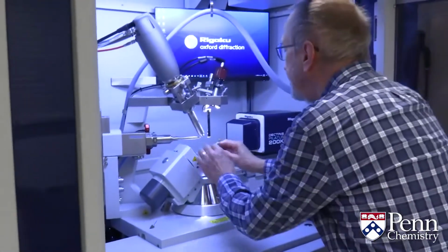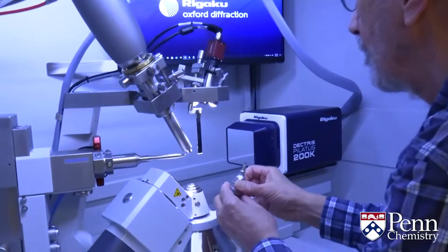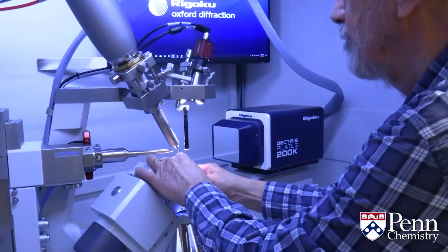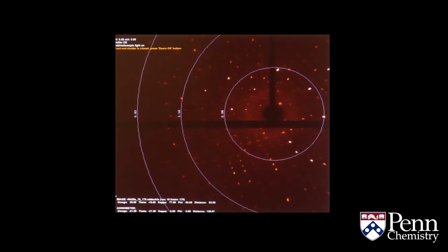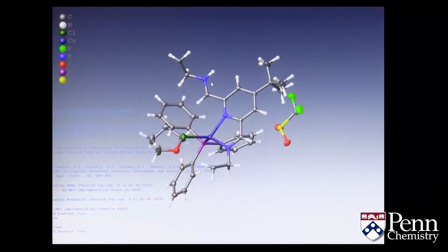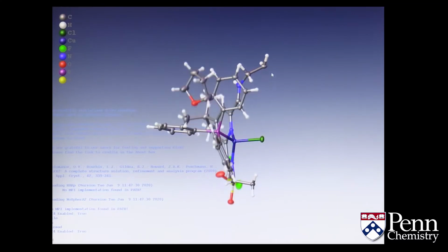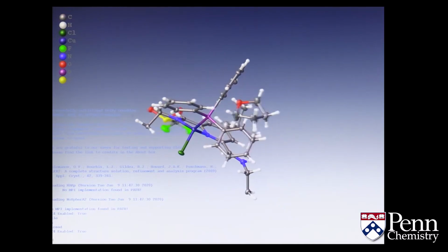I would have the X-rays take pictures through the crystal, and what I end up with is halfway through that process I mentioned earlier. I end up with a diffraction pattern, and then the computer converts that diffraction pattern into an electron density map. And from the electron density map, we locate the atoms. So we have this nice state-of-the-art software that will allow us to look at the molecule that we have just determined and play around with it and look at the interesting features of it.